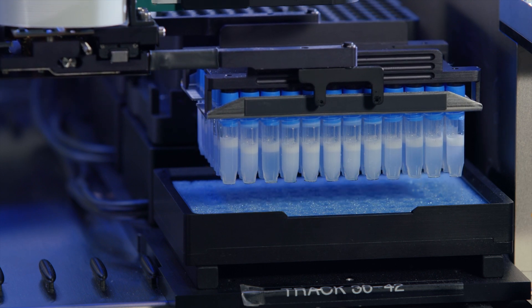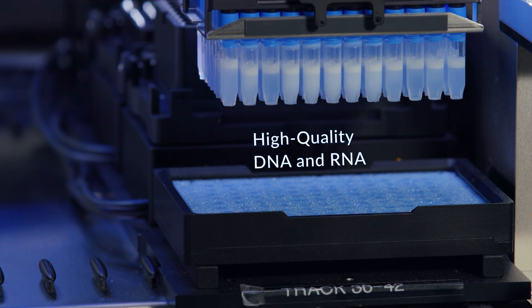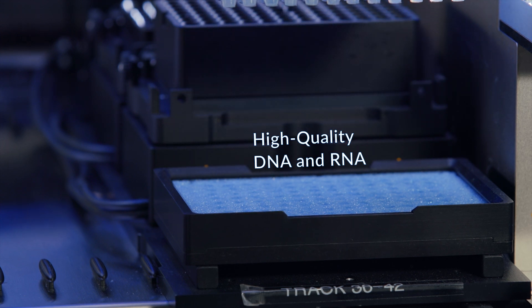This non-contact, temperature-controlled process ensures robust, high-quality DNA and RNA from the same sample, every time, for reliable downstream analysis.